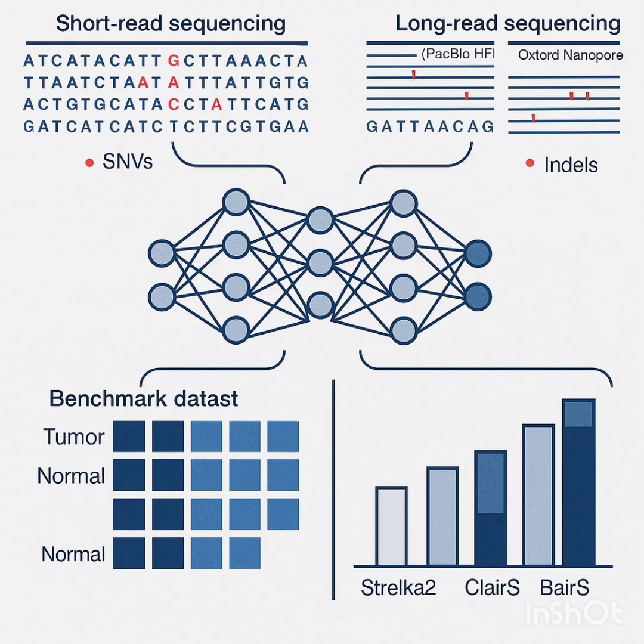But check out the long reads. On PacBio HiFi indels, DeepSomatic hits 0.815. ClairS, another long read caller, was down at 0.455. Wow, 0.81 versus 0.45. That's almost double the performance, roughly. It's a massive leap in reliability for finding indels with long reads. Really significant.